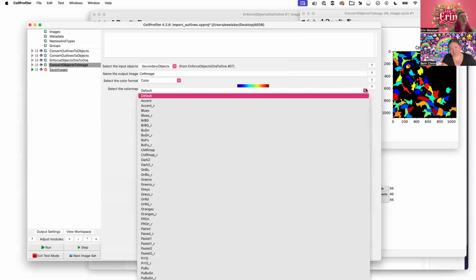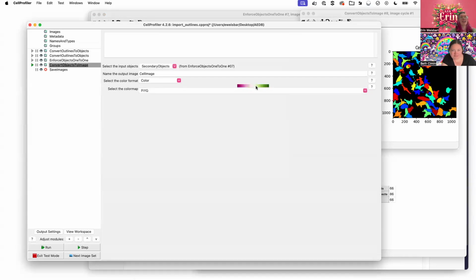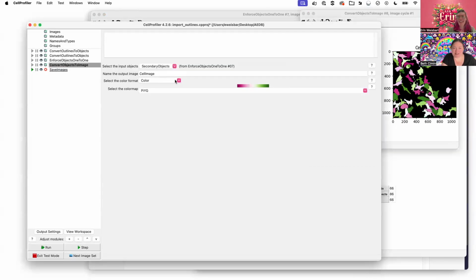And one could change the color map. There's probably, oh, what's the abbreviation? The pink green is always my favorite, but I don't remember the exact name. I figured it out. So one could change the color map and make it look like they want. This is maybe not the most helpful or informative color map, but it is fun because it is pink and green. The Jet haters in the audience will appreciate you changing it away from Jet.